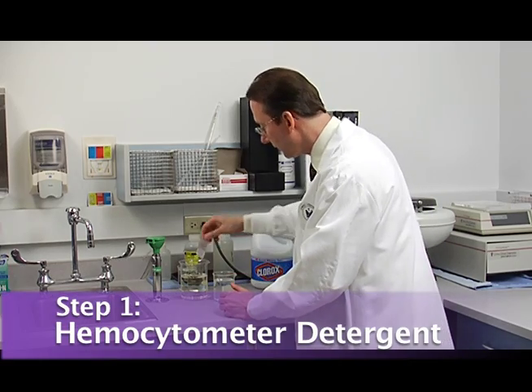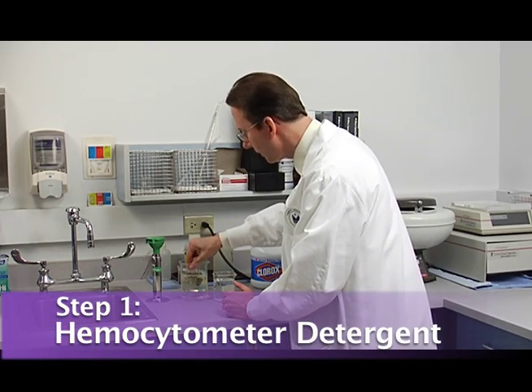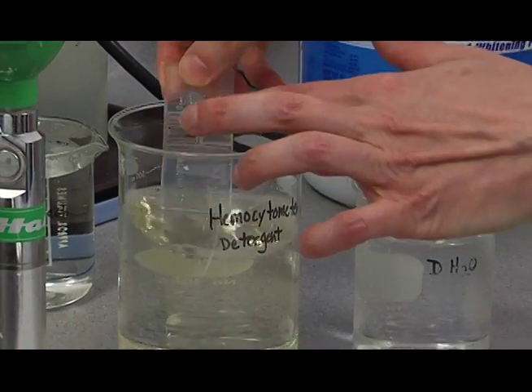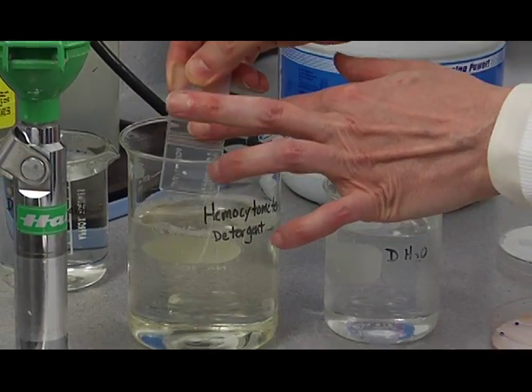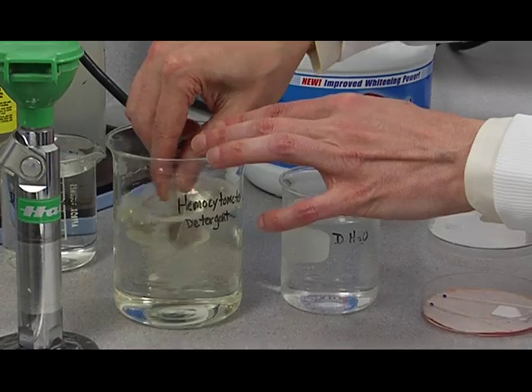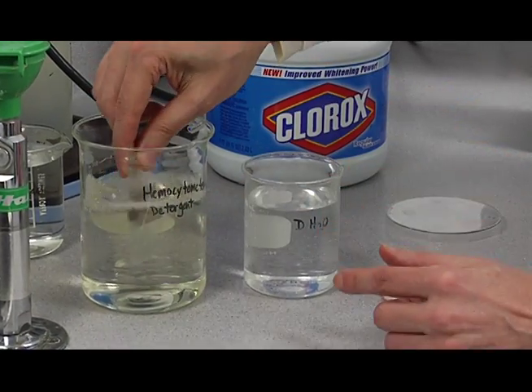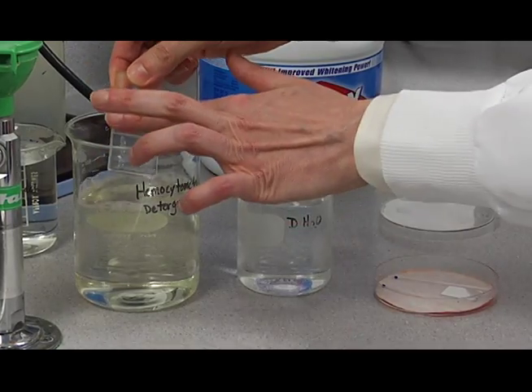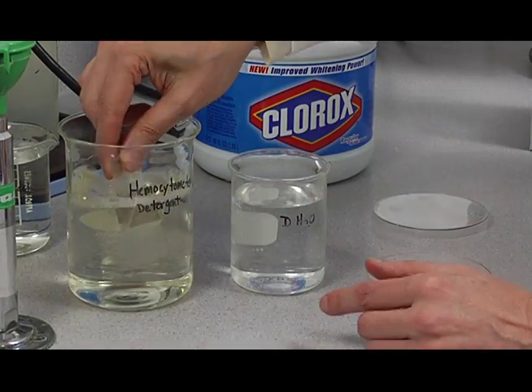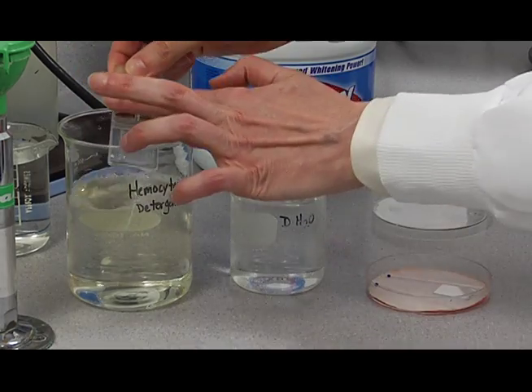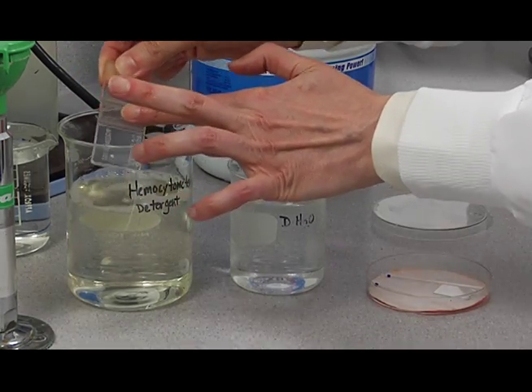So the first step is to swish it in the detergent like this, and then you can scrub it with your finger like this. And I do that three or four times, actually. The more time you spend cleaning your hemocytometer, the better. If it's not perfectly clean, it'll really throw off your counts.